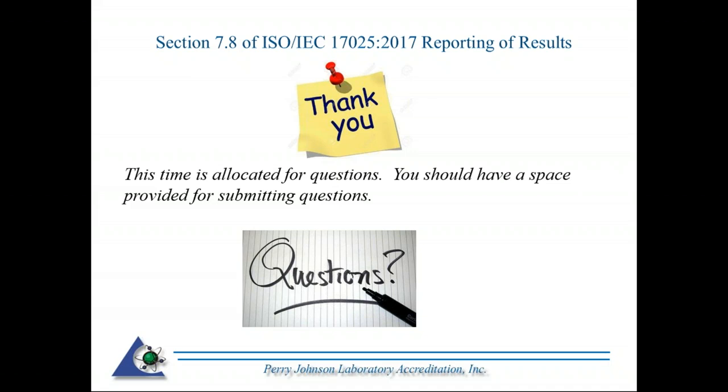You have a NIST traceable reference thermometer. How often should we send it out to a calibration company? You have to set a calibration program. So we sort of went over that originally, and it just depends, I would say, how critical it is to your testing or calibration. Just bear in mind, and this is not a requirement, perhaps a year and see if it drifted any. If it had, then something you might want to shorten. If it hasn't, then perhaps you have to do the R word, risk, and perhaps have a longer interval. There's a should there, so that's not a shall, and that's just my take on it.